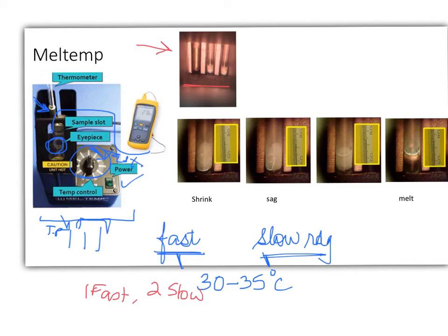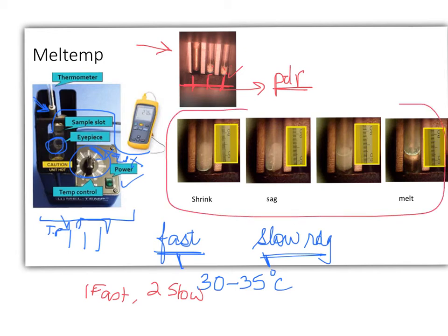Okay. All right. So let's take a look at this first picture. This is kind of like a close-up of a thermometer probe and the 2 test samples. Hopefully you can see what's wrong with the 2 samples is that especially in this middle one, they did not take the time to powder, which is why the result for the student also did not come out to be very nice. The second sample looks much better than the first one, but you can run 2 samples at any given point of time.